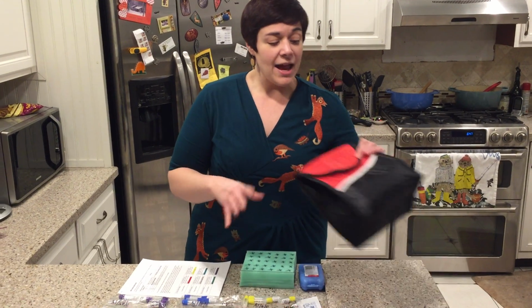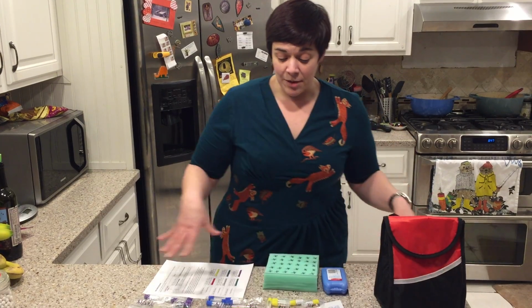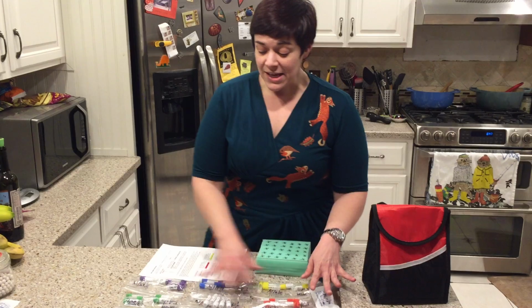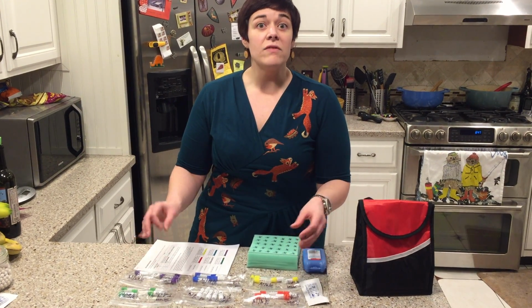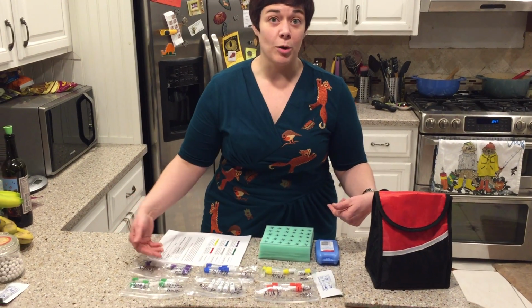So when the time is right, which for a number of you will be this coming Thursday, I'm going to hand out one of these lunch boxes to you during rehearsal. And in it is going to be basically everything you see here on the counter. You're going to have 6 bags, each filled with 5 tubes of a specific color. So you see a bag of red, yellow, white, blue, green, and purple.